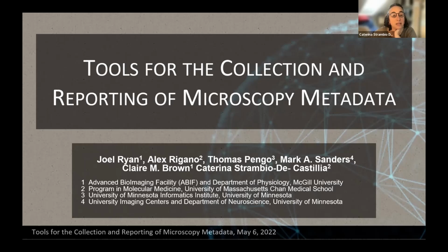Hi, my name is Caterina Strambio de Castillia. I am at UMass Medical School. I am a Chan Zuckerberg Imaging Scientist, which has allowed me to dedicate a lot of effort to this work about reporting and reproducibility. And I'm very grateful also to the 4D Nucleome project that has allowed me to develop the Micro-Meta app. Thank you.